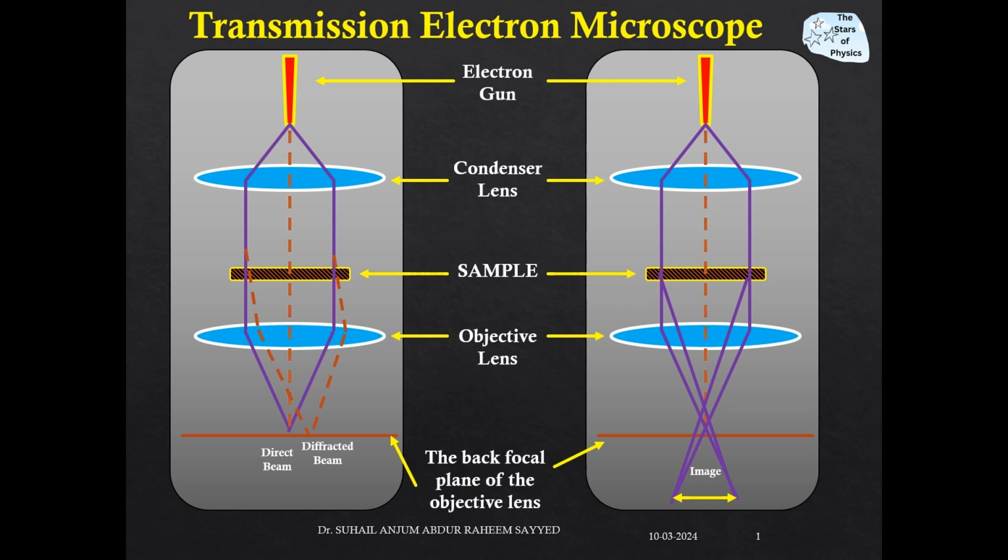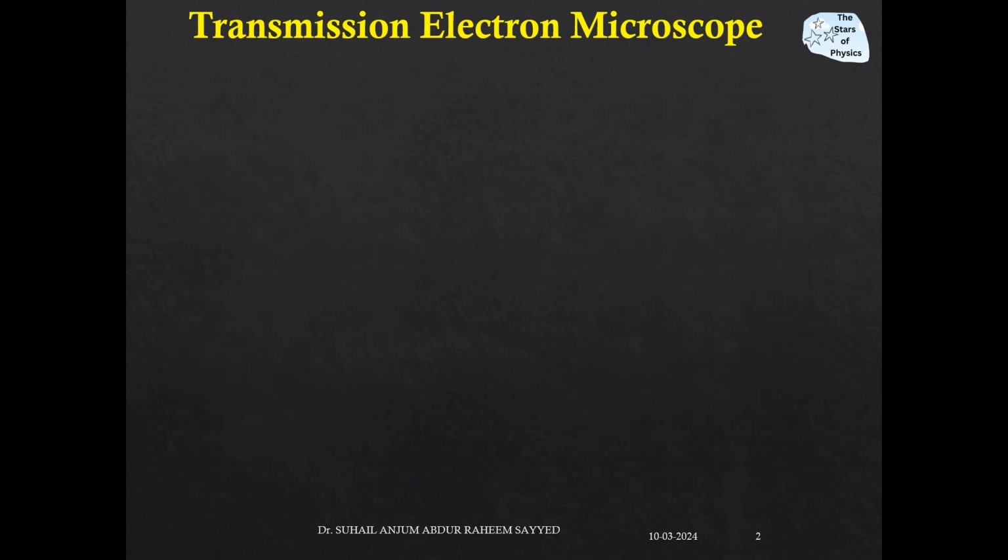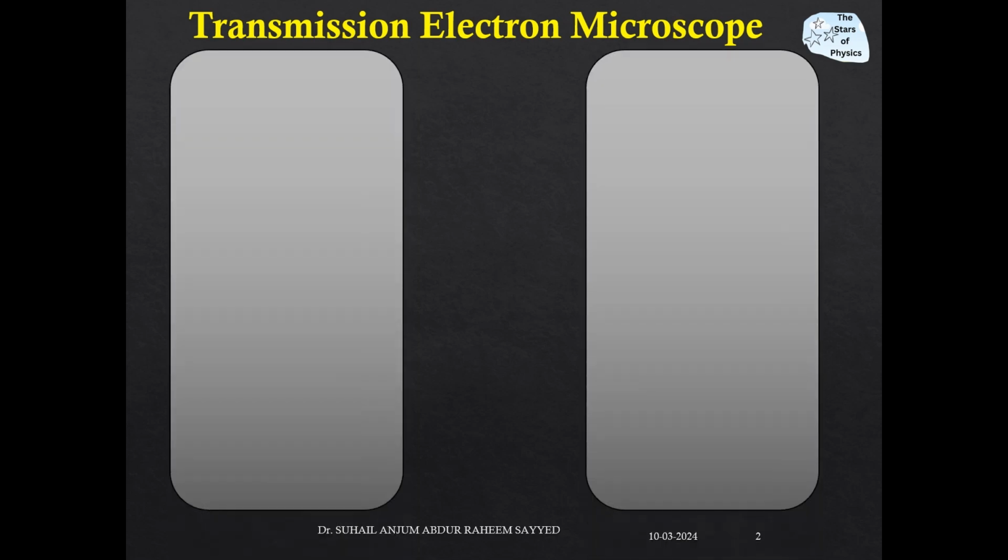Hello and welcome back. In this video, we shall see what is called transmission electron microscopy. So first of all, we'll see the instrumentation of the transmission electron microscope.